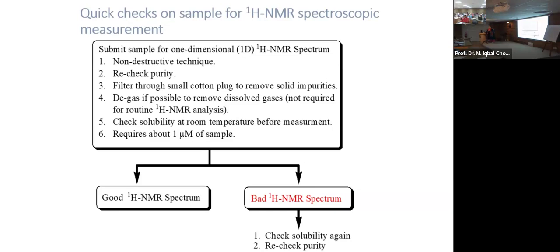Okay, and then 1 degree and 1 degree, you have to wait. So if you want, for example, to decrease or increase the temperature by 5 Kelvin, it will take half an hour or maybe 20 minutes. You just need to have a stable temperature when you record your sample. All right, so you have that much control.